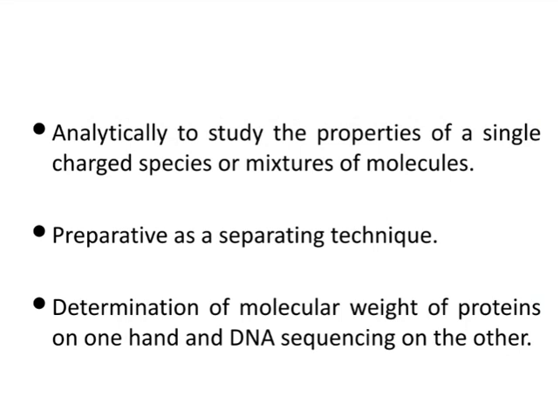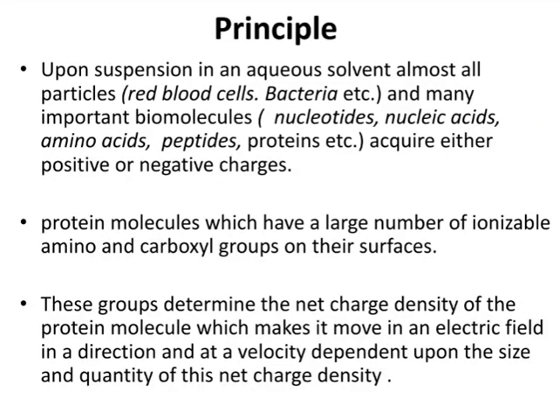Analytically, this technique is used to study the property of a single charged species or a mixture of molecules. This technique is also a preparative technique, and it is used to determine the molecular weight of proteins on one hand and for DNA sequencing on the other hand. Now, as I have said, electrophoresis is based on the charge of the molecule. So let's look into the details of the charge.